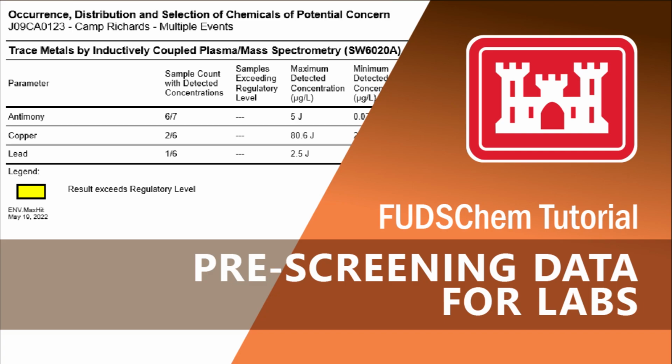This video will show how laboratories can pre-screen data in FUDSChem by accessing data from previous sampling events. This can help the lab determine which samples may need dilutions, preventing contamination of instruments, and saving time and effort.